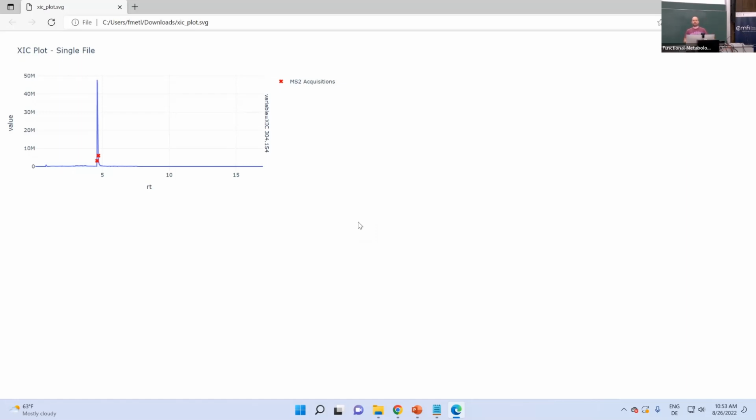All right, I think that was pretty much what I wanted to show you. So now, as we move on, I would suggest that you play a little bit around with it and then try to export some views, both on the MS1 or MS2 level, and then add those into your vector graphic program.